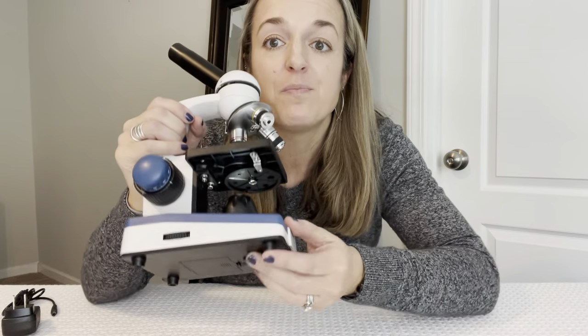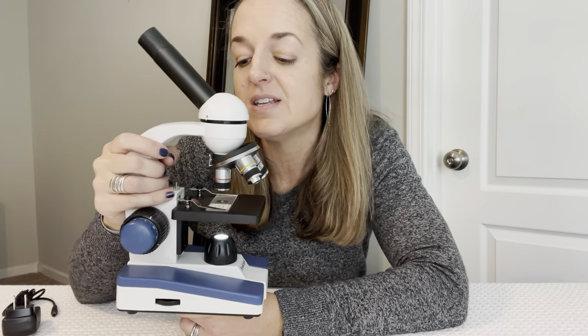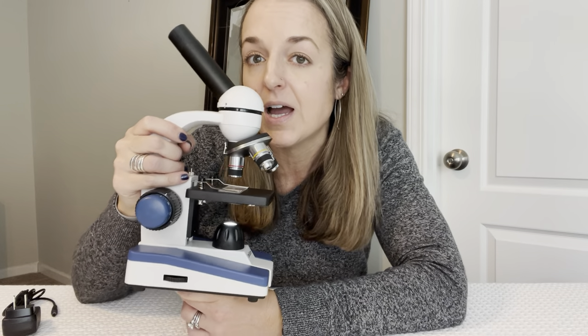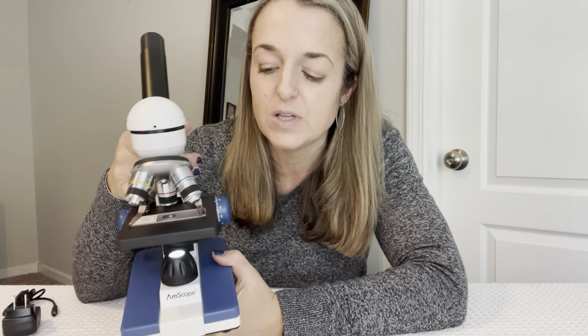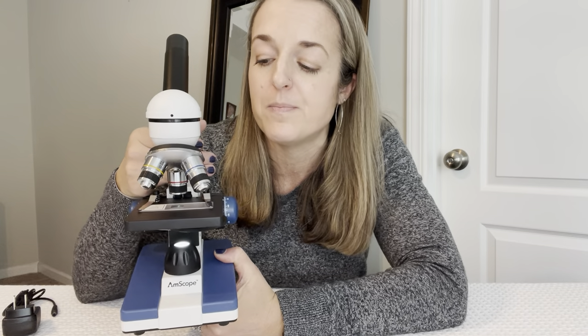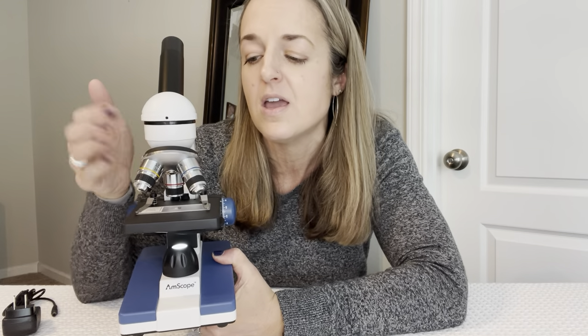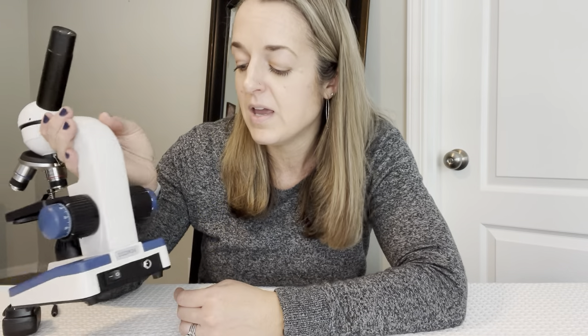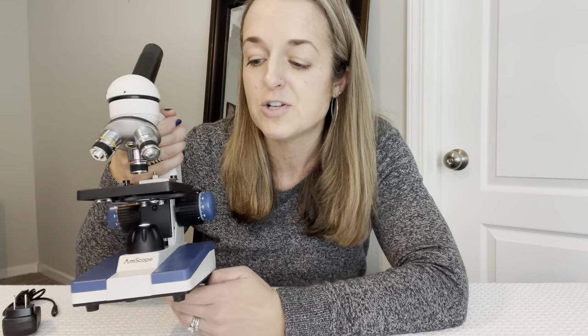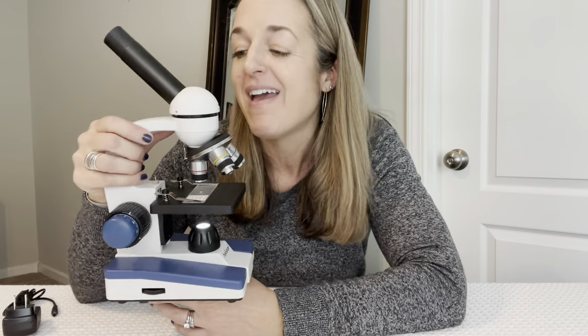This microscope is made of metal, has little feet on the bottom, and feels very substantial. I bought this for a homeschool community for high schoolers to use — it really is that caliber of microscope. It's really easy to adjust and get to see what you're trying to see. I highly recommend this; it's awesome.